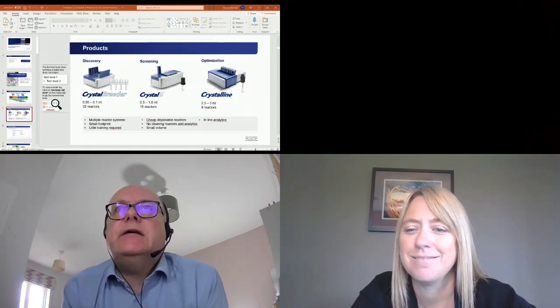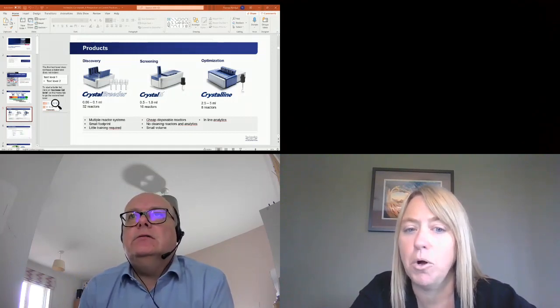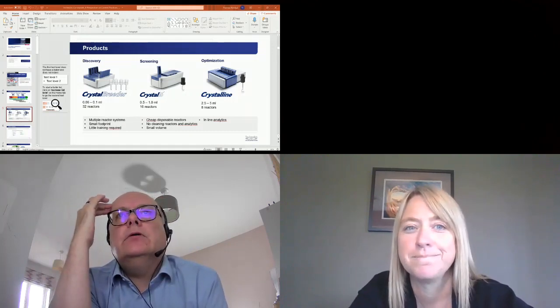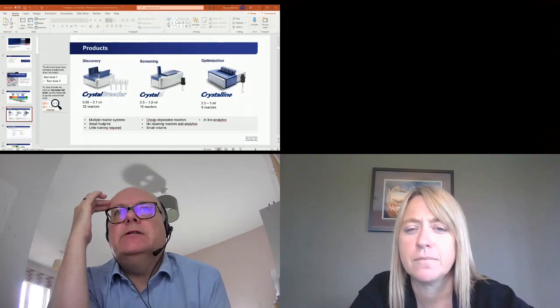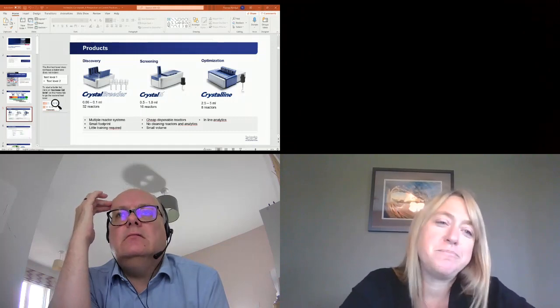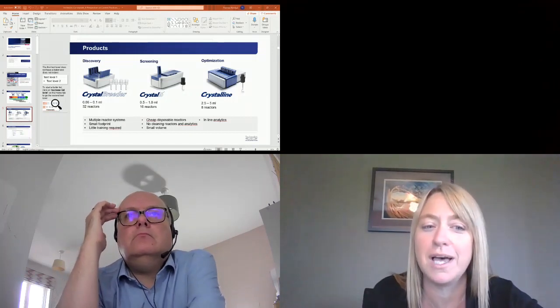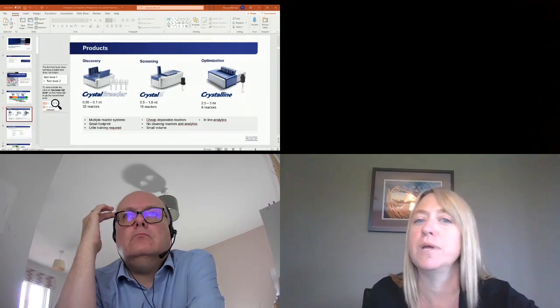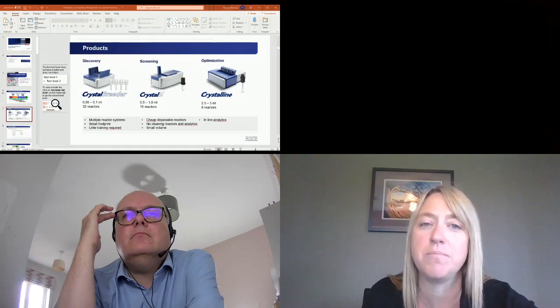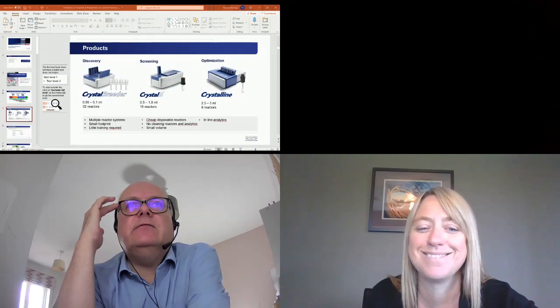Okay. And the Crystalline, I guess it has overhead agitators, which is good. Yeah, all three of the products have the option of overhead stirring. Okay. And in terms of the stirrer configuration, can you get different stirrer types? I guess you can. We have, and I always make jokes that my chemists enjoy and use more our dough hook design, whereas my chemical engineers tend to stick with the 3-blade traditional impellers. Okay. I guess everybody has their favorites, don't they? They do.